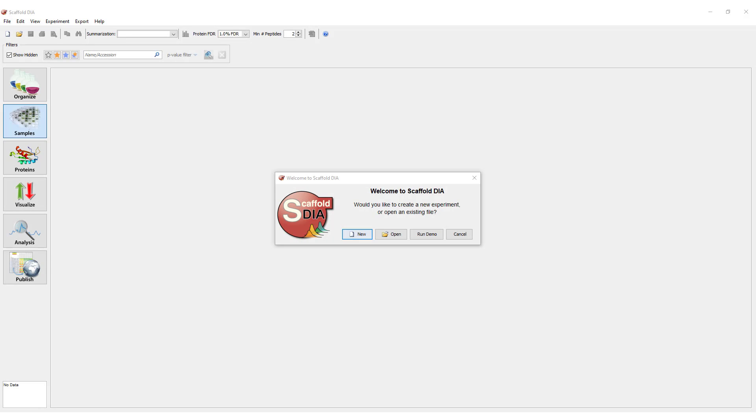This tutorial assumes you have already installed and activated Scaffold DIA on your computer. If you have not, please do so.